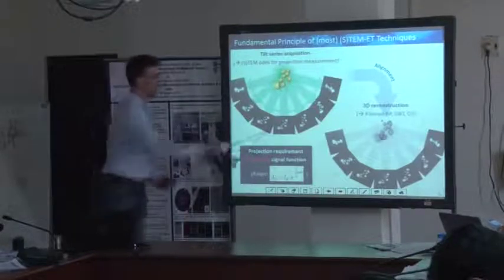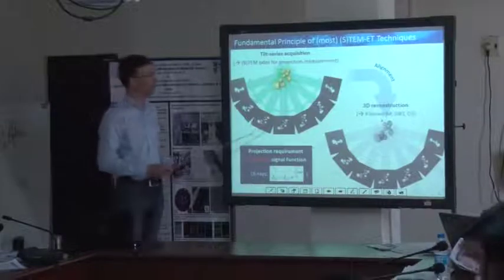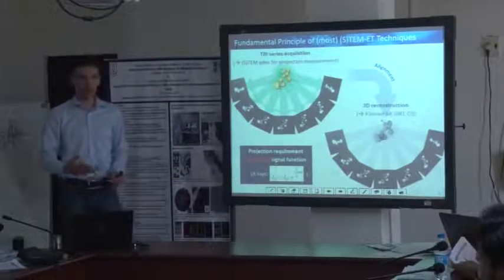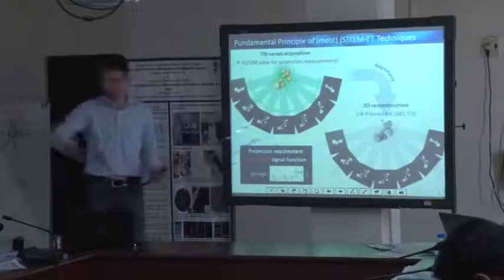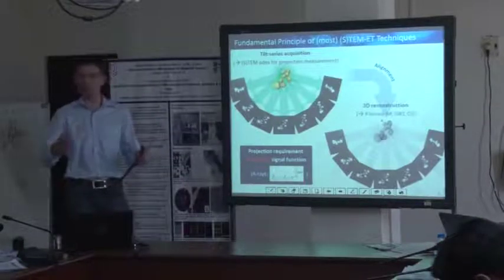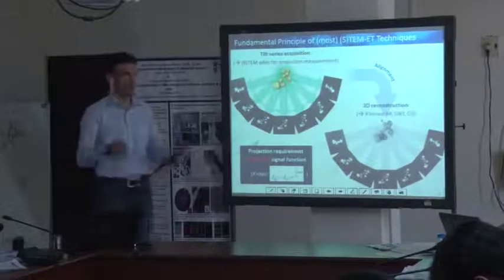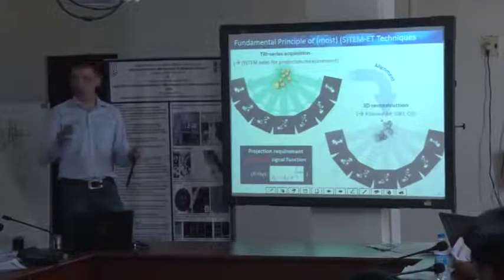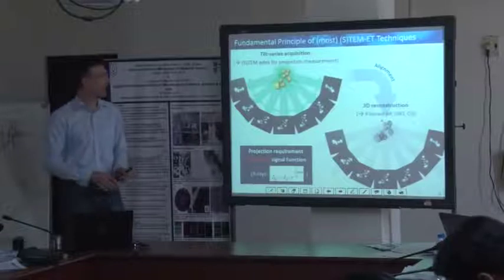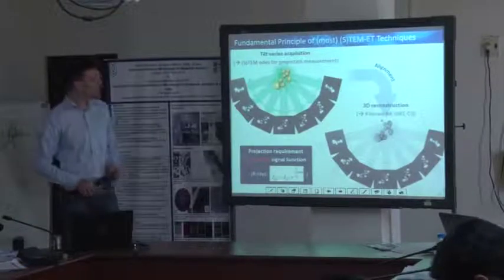So we need the tilt series first, and we have to align that tilt series, so we have to spend a lot of effort in aligning the microscope because we have to tilt very precisely, so the sample shouldn't shift very far because we want to keep it in our field of view. There are many automated alignment routines that even follow our sample, so there is some drift correction for each tilt angle. But in principle, this is what we derive. It's a tilt series of images.